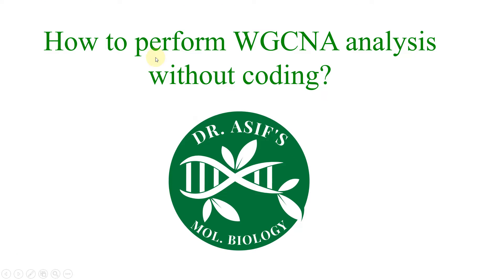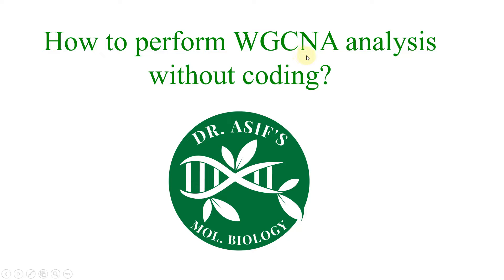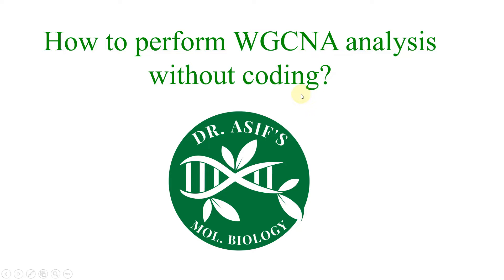Welcome to another video tutorial. In this video I will tell you how we can perform WGCNA analysis without any requirement of coding. In this video I will not go into the details of what is WGCNA analysis and what are its limitations and uses. However, I will only perform WGCNA analysis using an online tool.